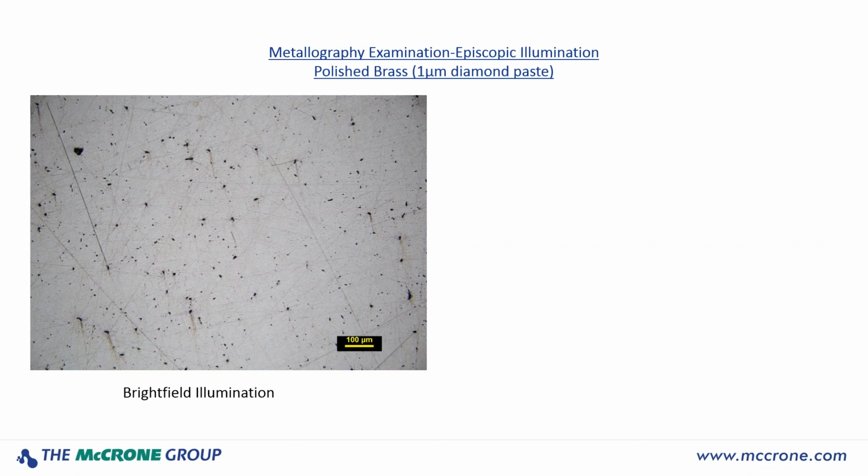So I'm going to finish up a little bit here to give you 4 different images of the same region, same field of view, using each of these 4 techniques to show you what they can really tell you. Here's a polished brass. It's final polished with 1 micrometer diamond paste slurry. And the bright field illumination is what most metallographers would be looking at to look at their polishing system. But we can see that this one isn't polished quite well enough yet.